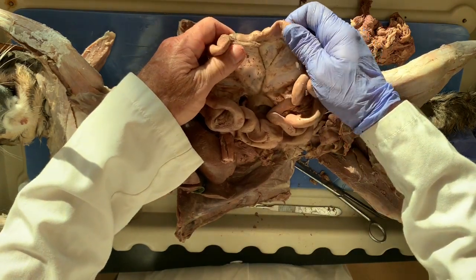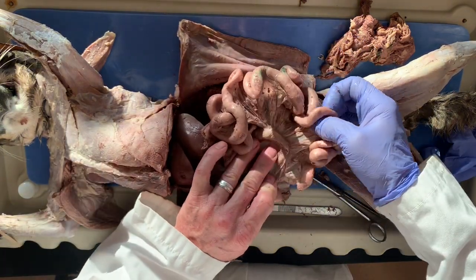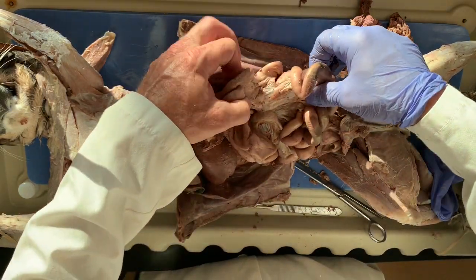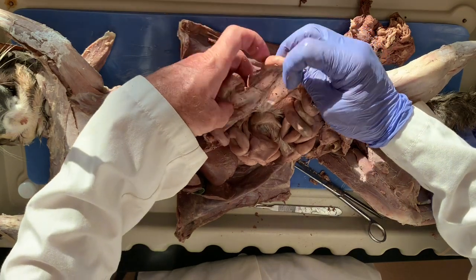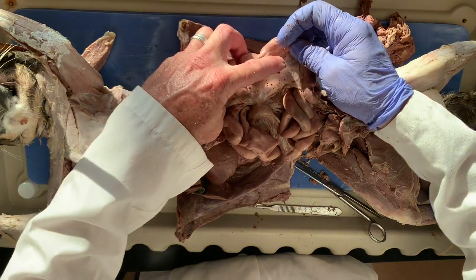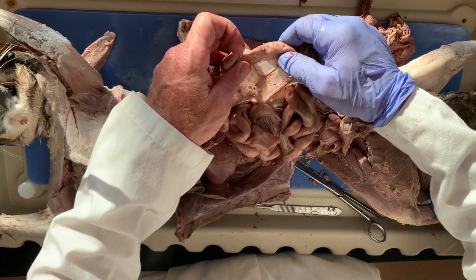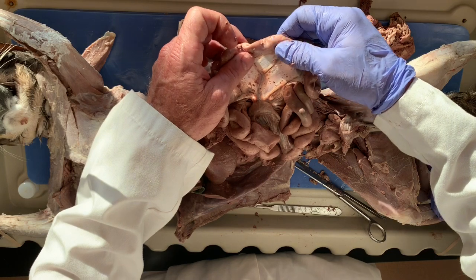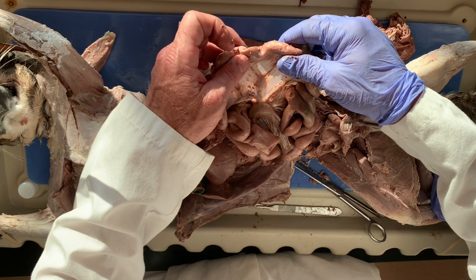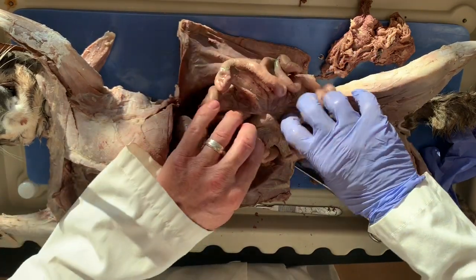This is called the mesentery. And the mesentery binds all of the intestines together. This is so it doesn't strangulate the other organs inside of your abdominal cavity. And you can see if we spread it apart, you can visualize the blood vessels that carry the nutrients of digestion, the amino acids, the glucose, the fatty acids, away from the intestinal lining to the liver to be filtered, and to the kidneys to be filtered out. Okay, so this is pretty cool. It's like the stained glass of your abdominal cavity.